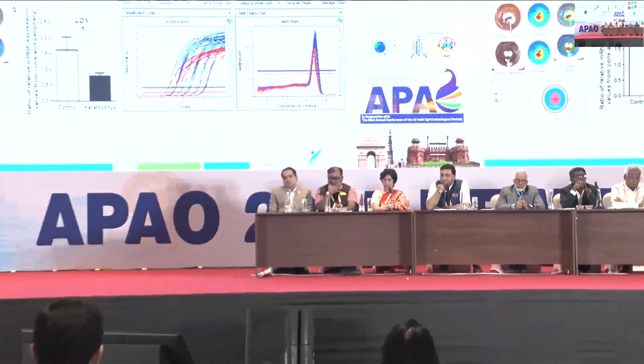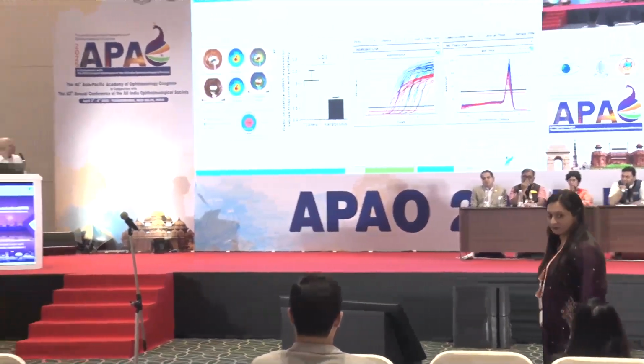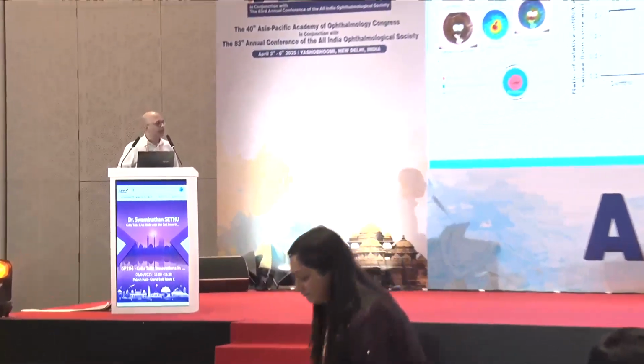Can make it a little bigger. No, not that. The video on the other side, qPCR and Western blot, please. Yeah, we can focus on the live. We can take the slides off. Make it live, and the last one would be on iPSCs. iPSCs, yes, pluripotent stem cells. That's right. And this is the work where you can see those graphs when you're studying those multiple genes.